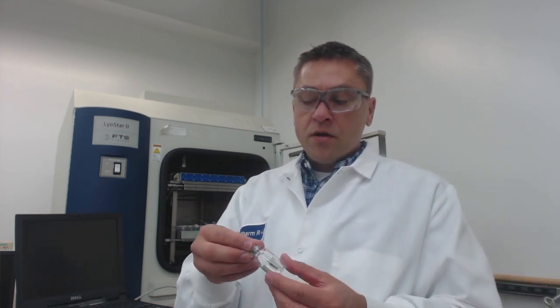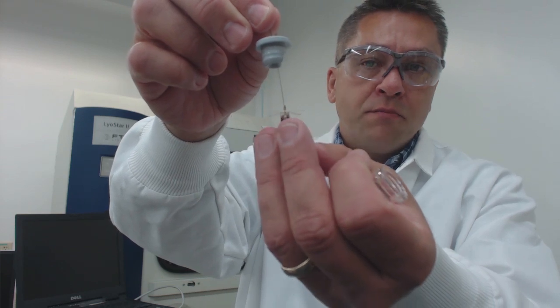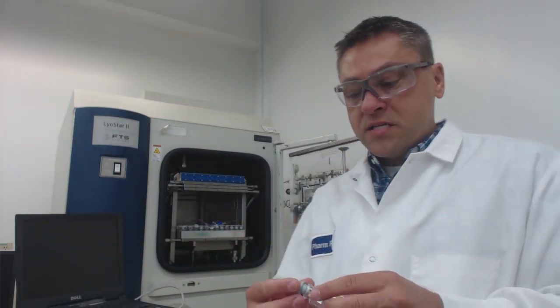There are other types of thermocouples that we need to be aware of for temperature monitoring systems. We won't go into all the details here, but there's an RTD. There's a thermocouple that we place directly into the vial. And then there's also these wireless temperature sensors. This one happens to be from Tempris. You'll see it has a glass bottom to it. That bottom contains a crystal that vibrates. And that vibration or oscillation will directly translate into the temperature of our product.